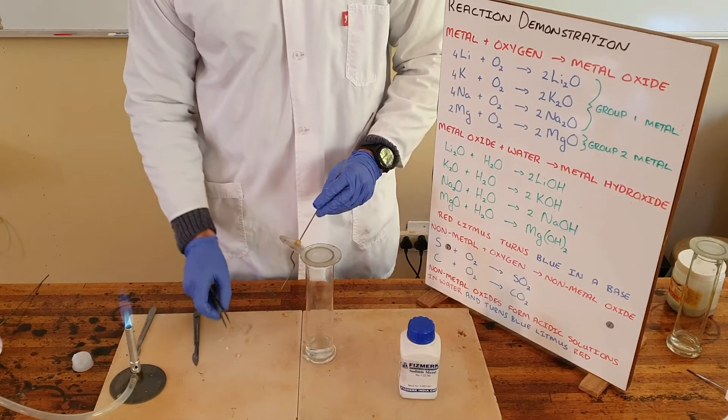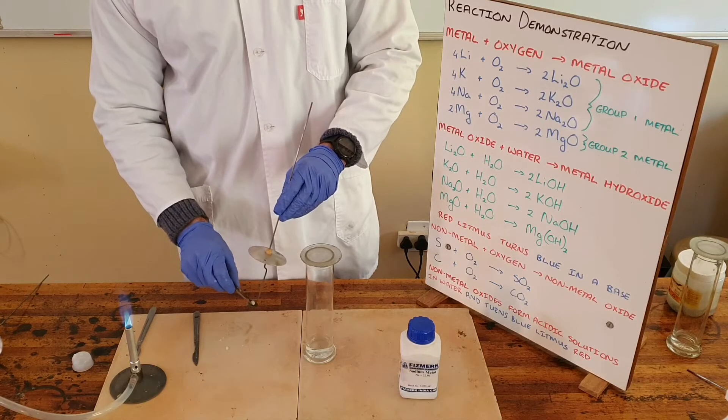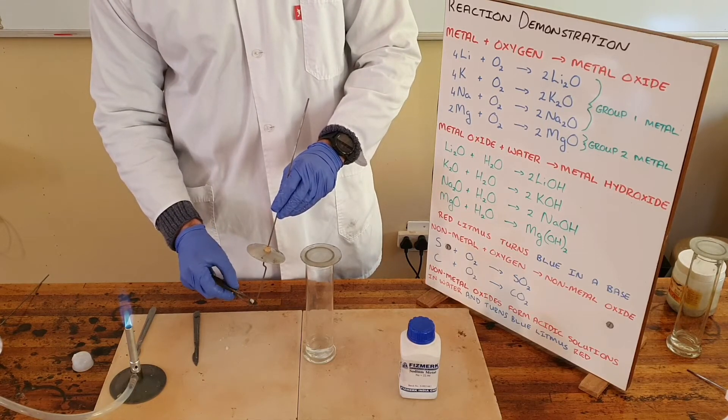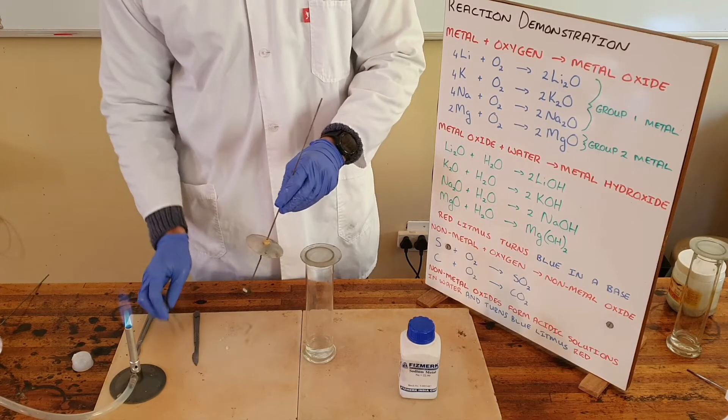We can demonstrate the reaction of another group one element, this time sodium with oxygen, to show that general word equation where metals react with oxygen to form metal oxide.